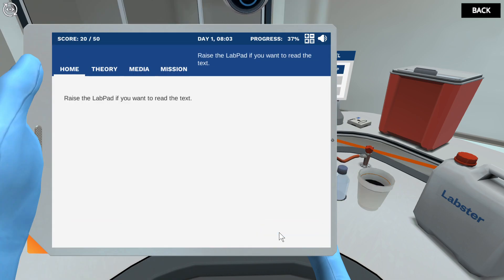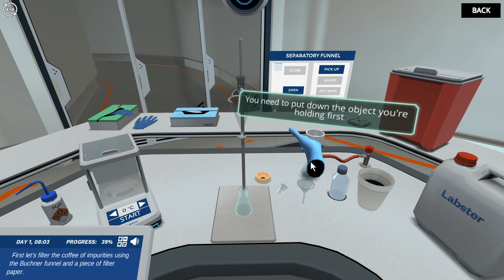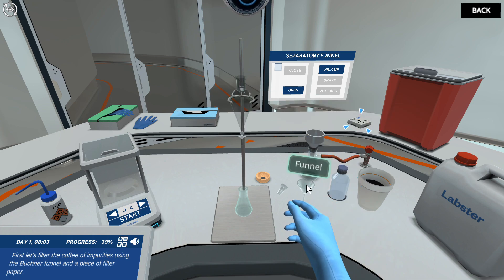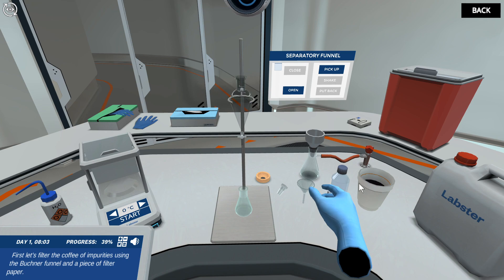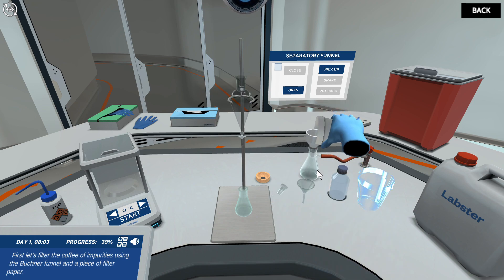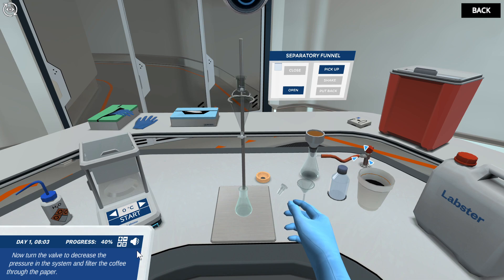First, let's filter the coffee of impurities using the Buchner funnel and a piece of filter paper. Now turn the valve to decrease the pressure in the system and filter the coffee through the paper.